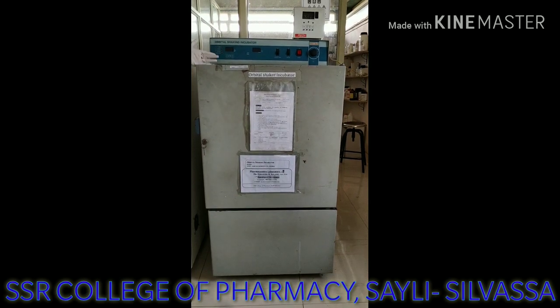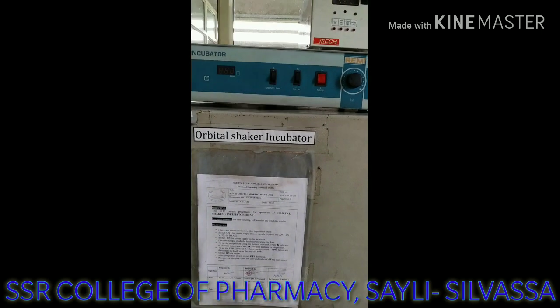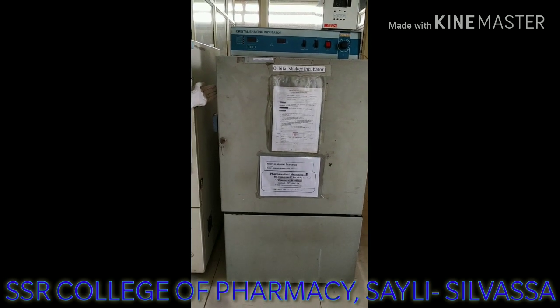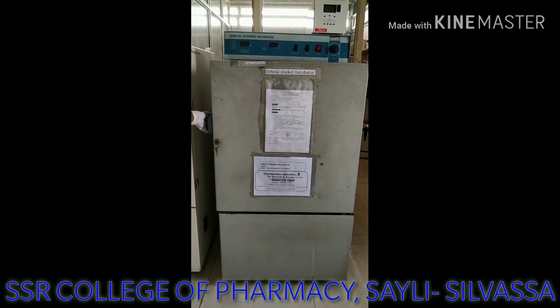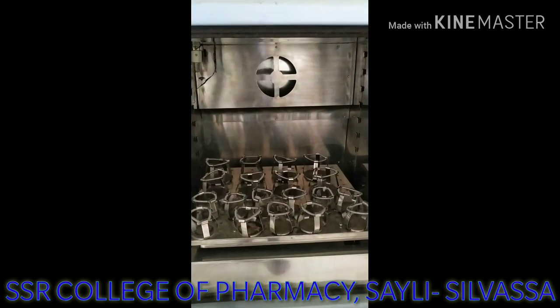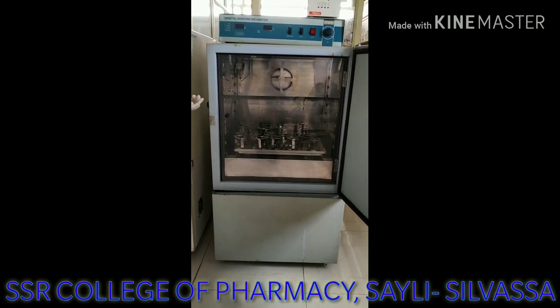This is the exterior portion of the instrument, which shows that it is made by Remy, and the model number for this particular instrument is CIS24BL. This instrument is constructed of double walls. The exterior is made up of sheet steel, while the interior portion is made up of stainless steel. This portion is called a plexiglass, which makes it possible to inspect the specimens without disturbing the temperature.